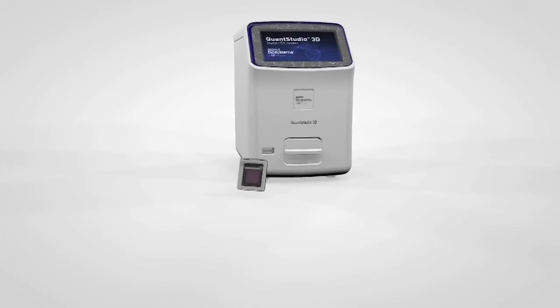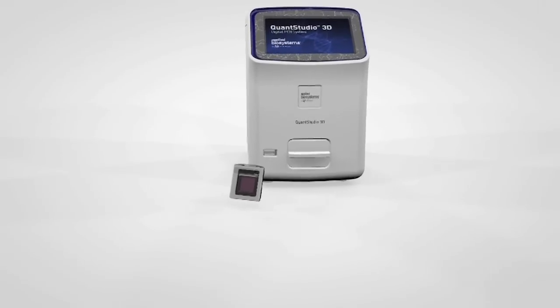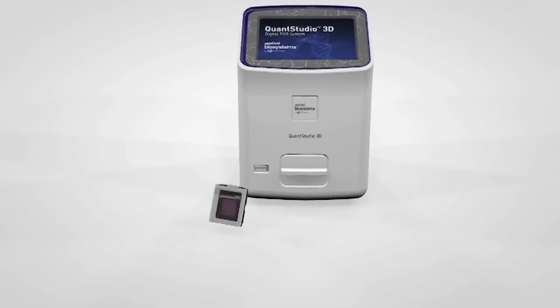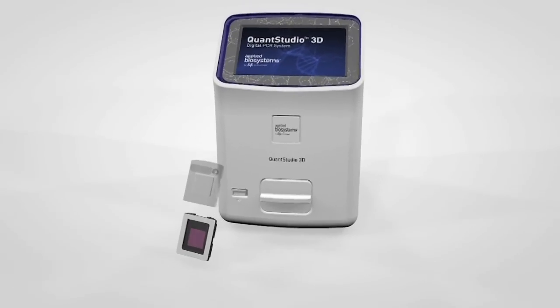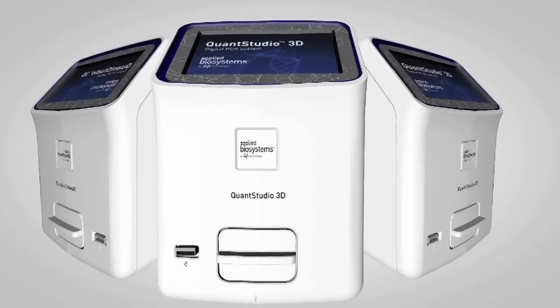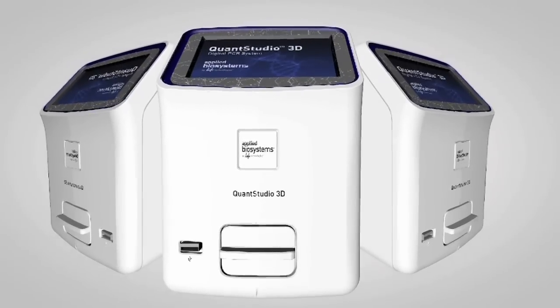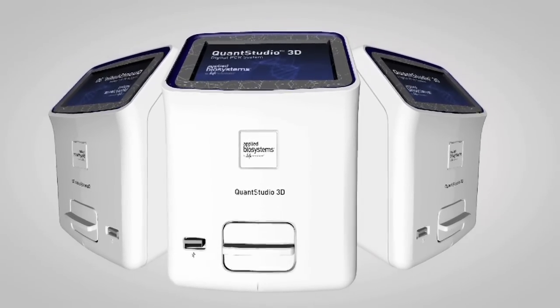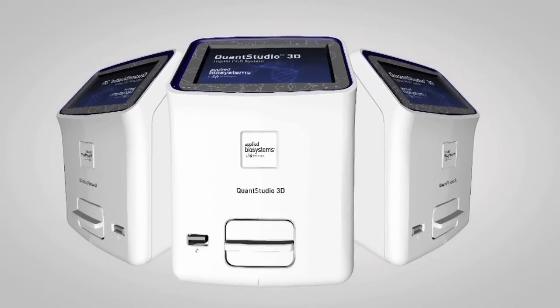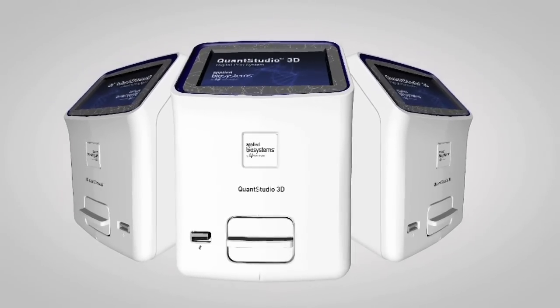The QuantStudio 3D digital PCR chip makes it easy for you to start doing digital PCR and it will continue to evolve with your demanding applications.